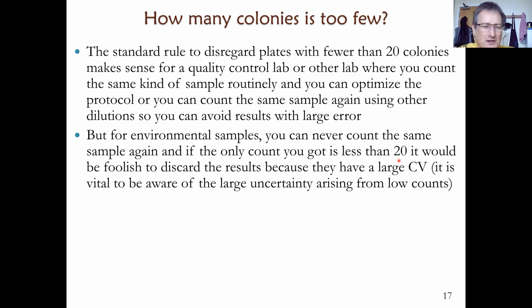But you also have technical errors, of course. You have pipetting errors, counting errors, and these are to some extent also unavoidable, but they can be minimized by good practice. And to estimate the technical errors, you really need to do a lot of independent dilutions, completely independent dilutions, not just different plates, but independent dilution series from the same sample, then use Gaussian statistics to estimate the technical error.